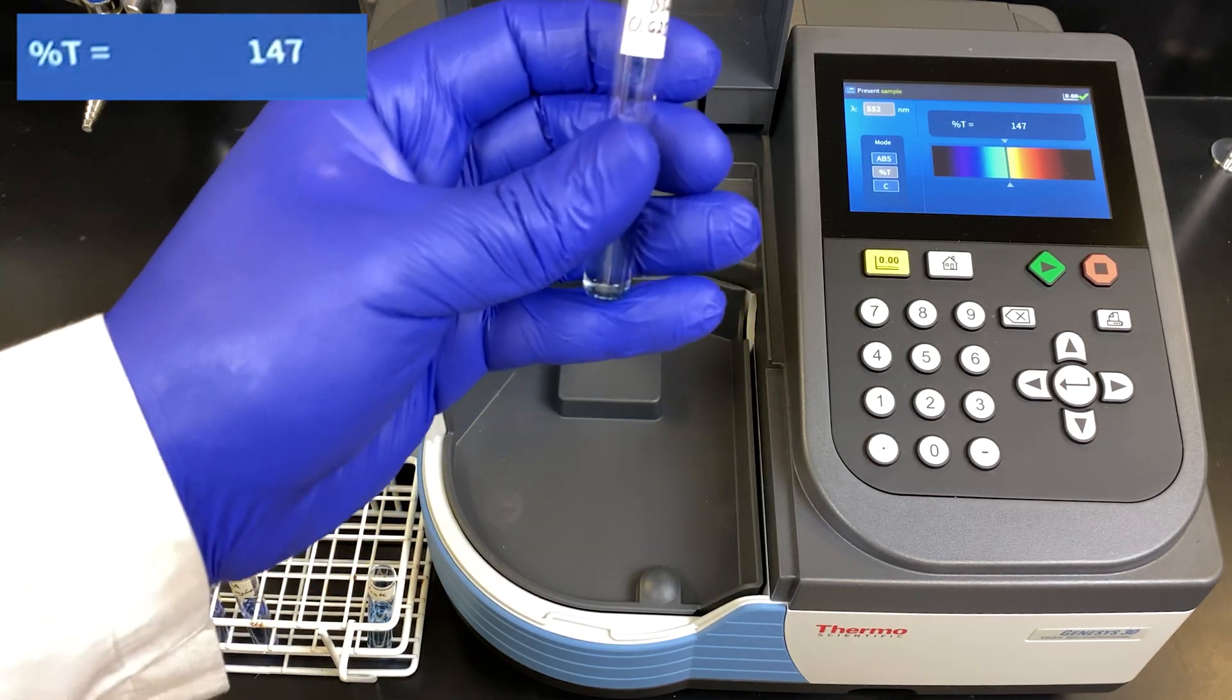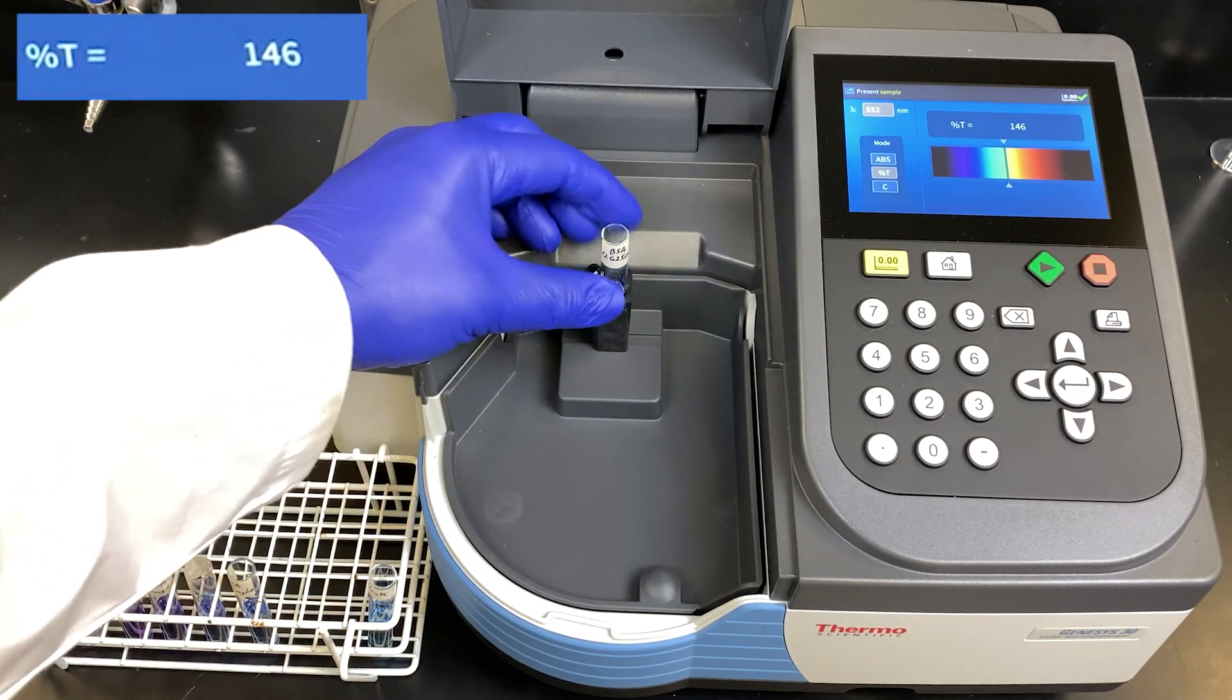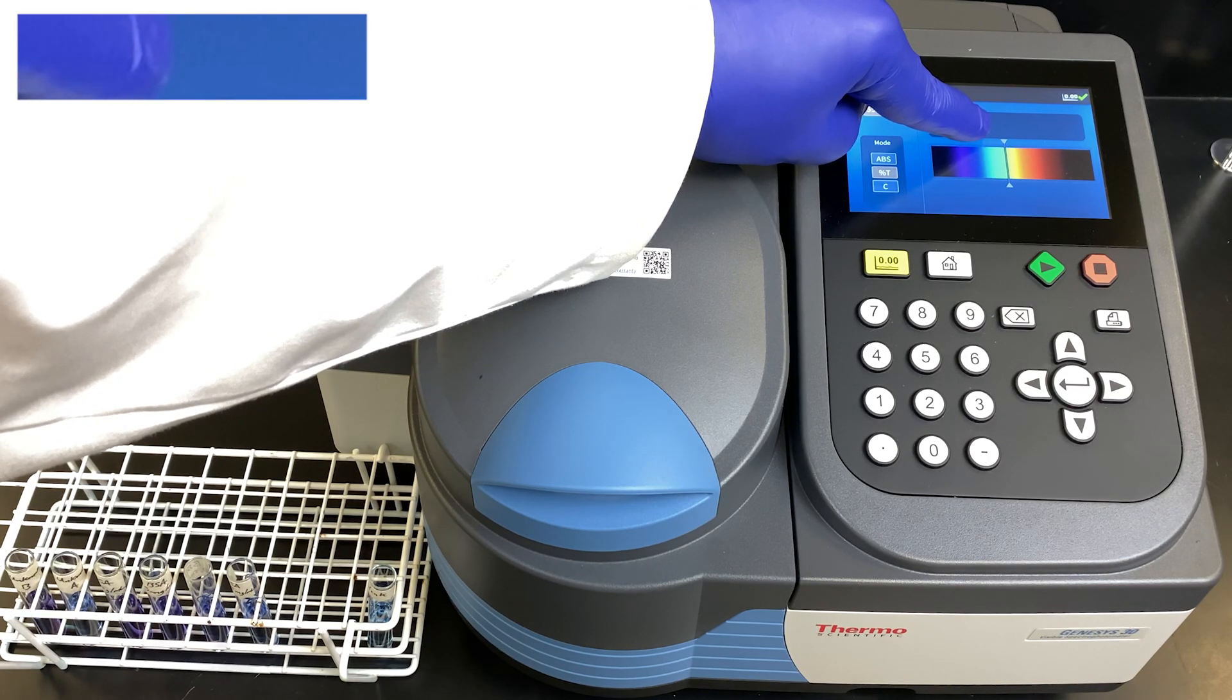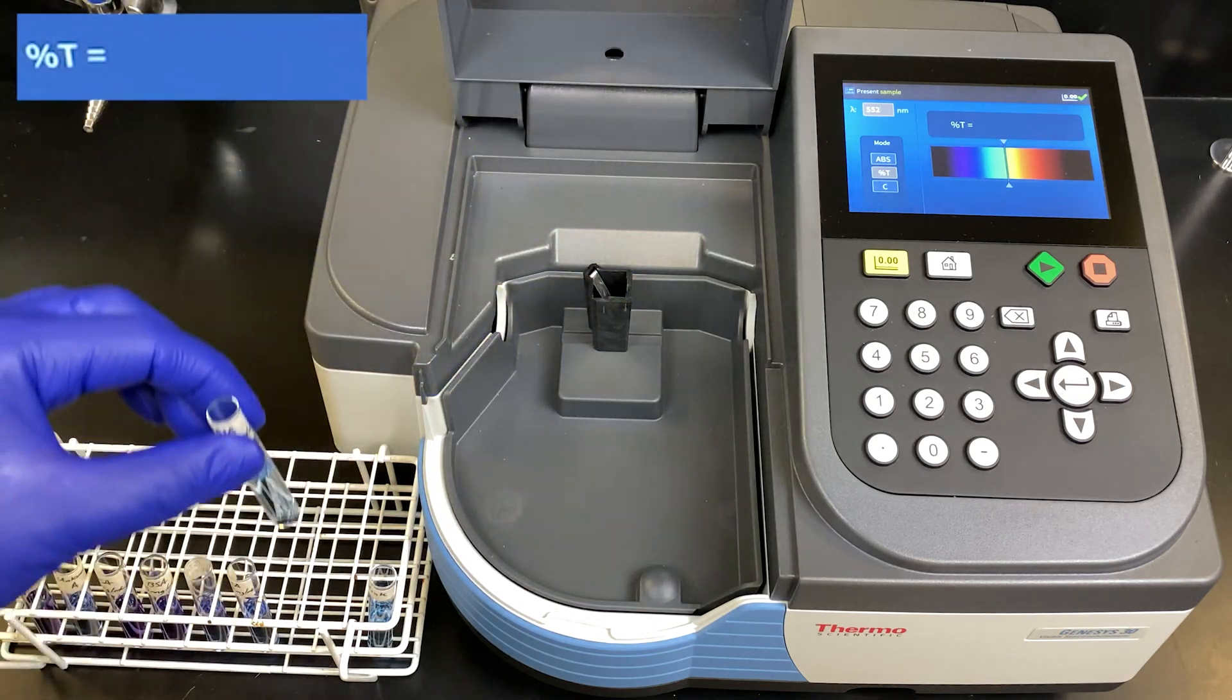We take our next sample, 0.625 milligrams per mL BSA. Place it inside. Close the door. You can read off directly. Wait for it to stabilize. We remove it. And continue on with the rest of the standards.